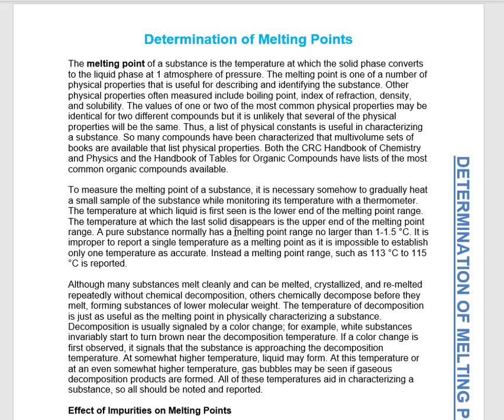So for instance, what is the melting point? Right, we've already said that. It's the temperature at which a substance will convert from solid to liquid phase. All right, and typically they do put in there that's at 1 atmosphere of pressure. So if the environmental pressure is different than 1 atmosphere, you can see shifting in your melting point temperatures.